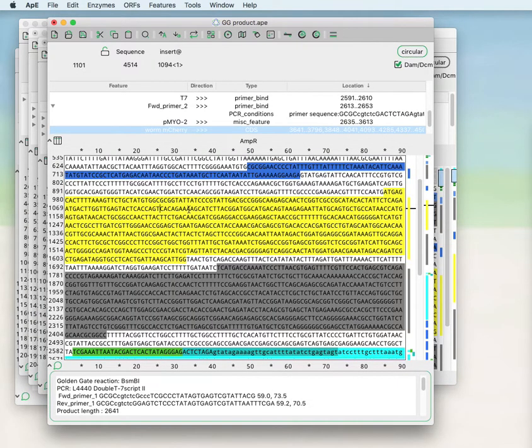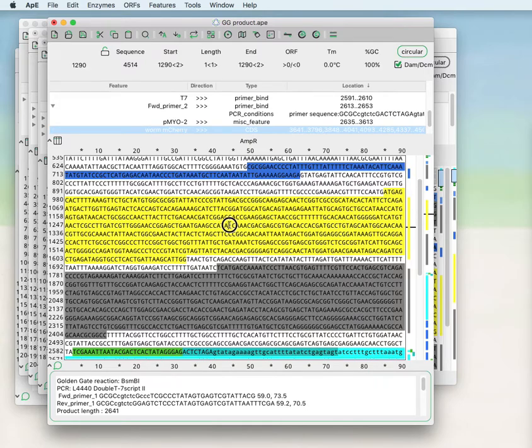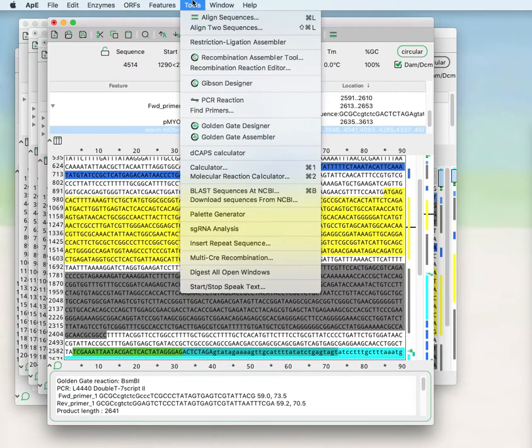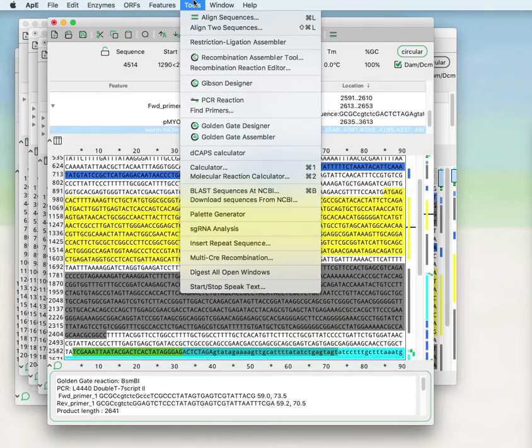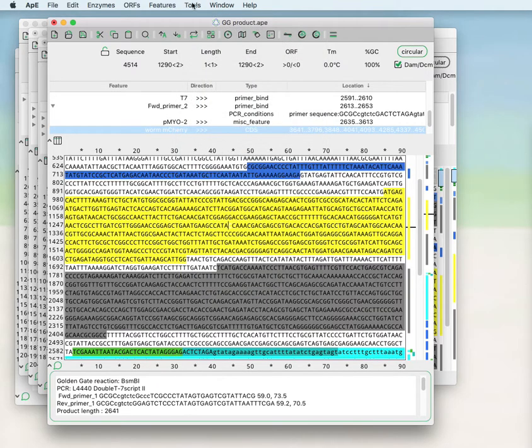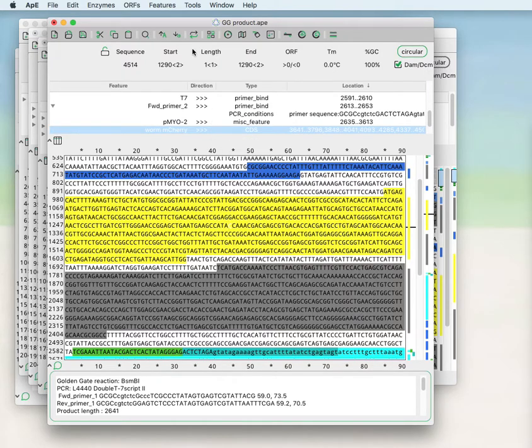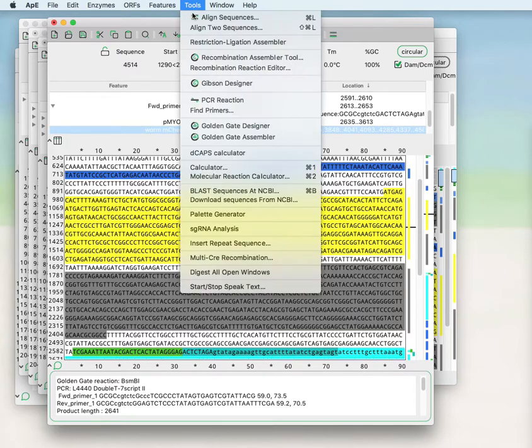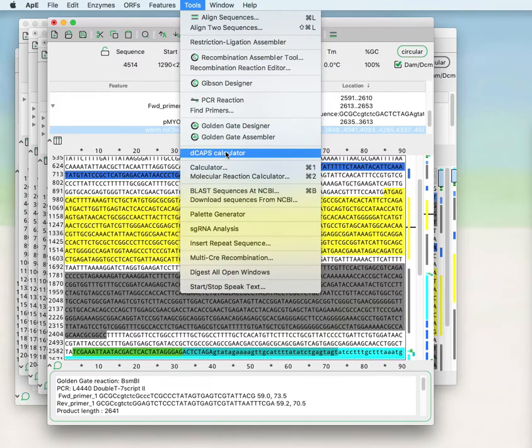Sometimes you might have a point mutation that you'd like to detect within a genomic sequence. For that, we have a tool called the dCAPS calculator. This is within the mutagenesis tools section. For example, if you had a point mutation of this C to a G that you'd like to design a PCR reaction to detect within a genomic region, you can use the dCAPS calculator within the tools menu.